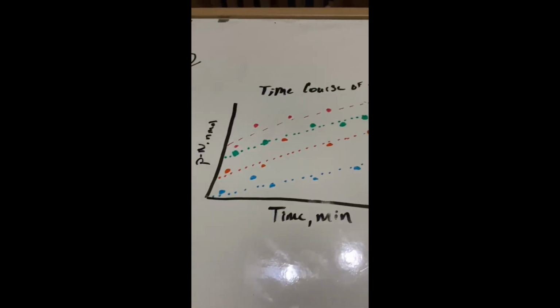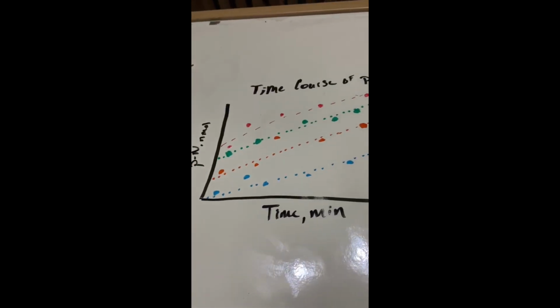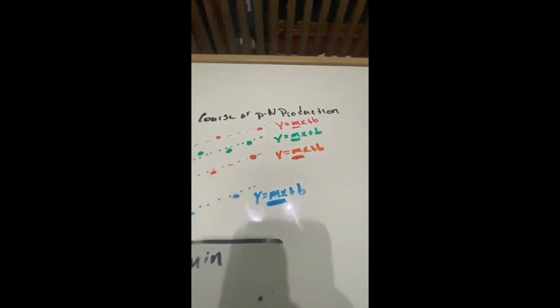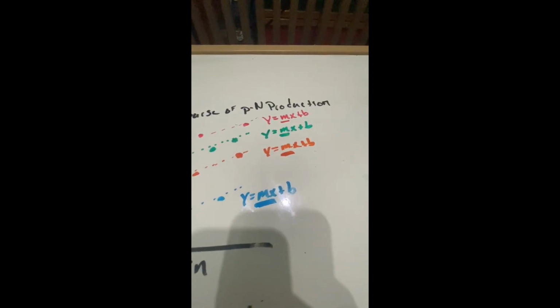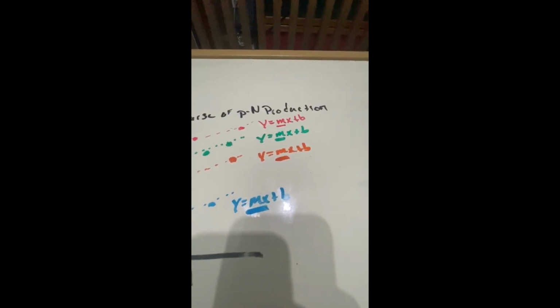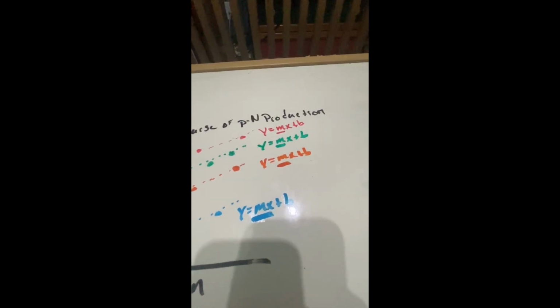We're going to go ahead and plot that into a scatter plot, which is going to give us the rate of reaction, and we're able to calculate a linear formula for this. M is going to be the most important variable of this and will be used in the next step of the experiment.